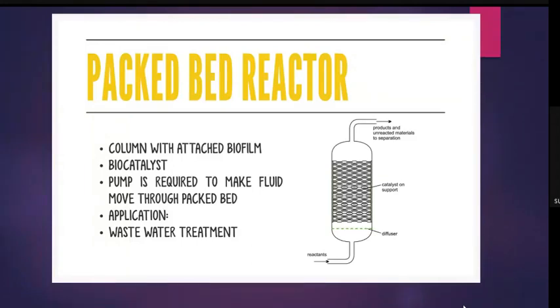And after a certain time, the incubation time and reaction time, it will be removed. We can also say that in wastewater treatment, where there will be a large number of suspended solids present, they will be completely removed in the packed bed column.